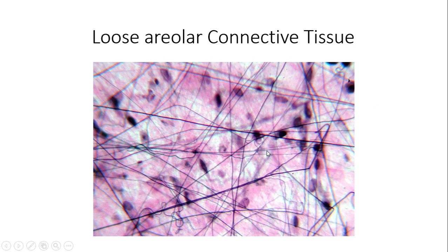I think some people say it looks like, actually no, forget about that. But it just does look like mostly webbing. And you do see many empty little spaces here. That's why they call it loose connective tissue, because it's not dense. It's not densely packed cells.